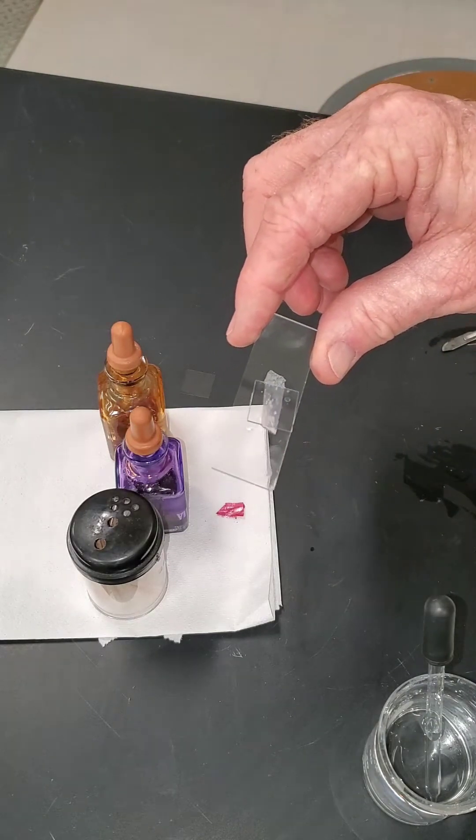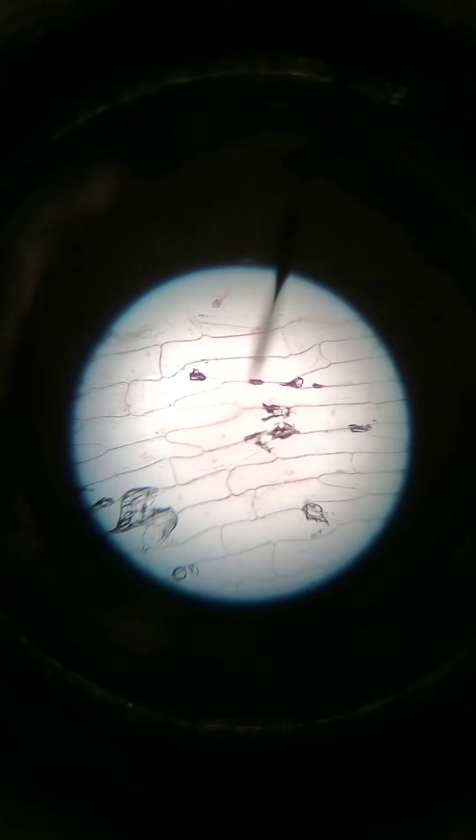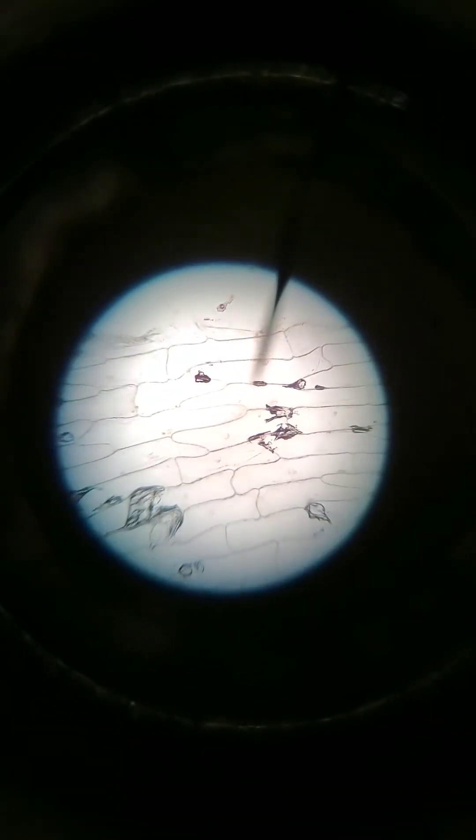Let's focus the slide and see what we've got. This is what we see on our scanning scope. We'll focus down, and you can see everything coming into focus. Now let's adjust the light just a little bit — that's much better. We can see much better there. So we have typical cells here of an onion, and this is what you would call low power.